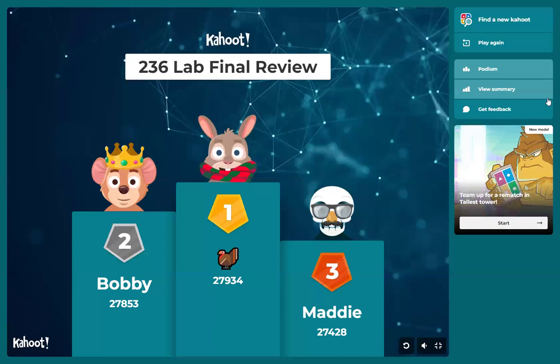If the organism uses the starch, it won't be there anymore for the iodine to interact with, so it'll create a halo effect around the growth. We didn't have any good examples of it in lab, because I had to be gone for a whole week because of weather or something. But usually it'll have a halo around that growth.